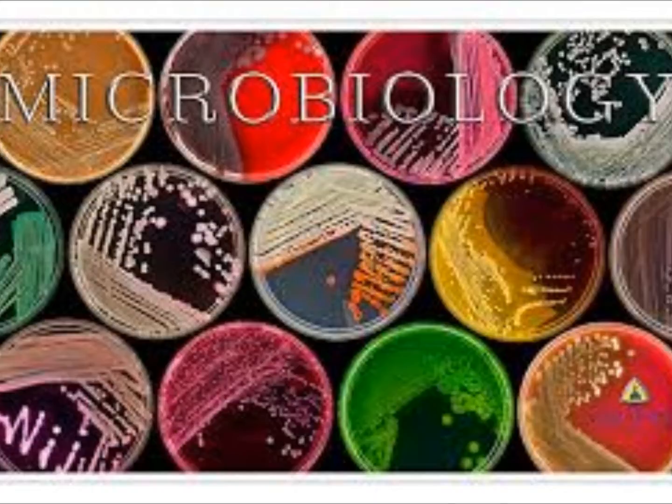And swarming. We do have an organism that swarms the entire plate, and that's always a Proteus. And you guys will see that, but you'll see the center of the colony on the plate, and then there is just a film of growth over the entire plate. And that is called swarming, and that's generally a Proteus.